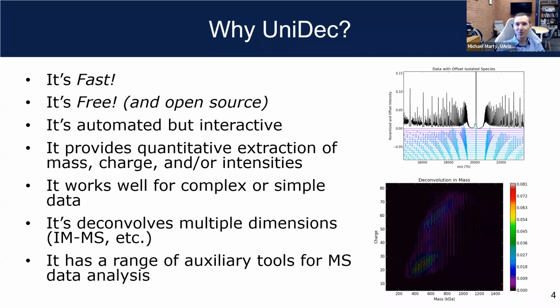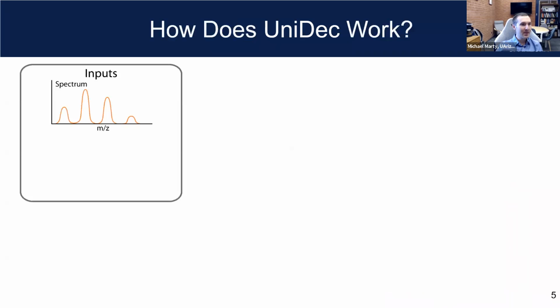And as the tool has grown over the years, it's expanded to include a lot of different auxiliary tools for native MS analysis. It's gotten a little out of hand, if I'm honest, but there's a lot in there that you can use if you know what you're doing. So I want to briefly go over how the algorithm works.